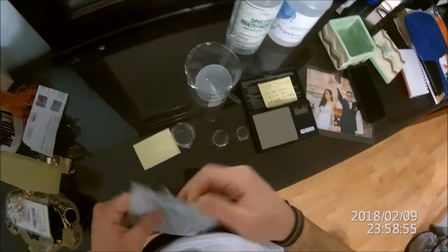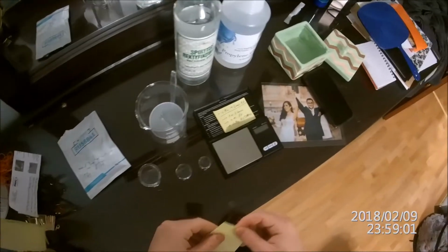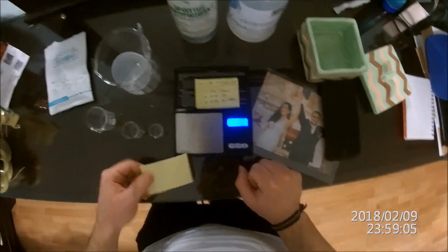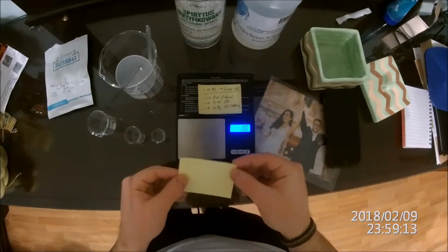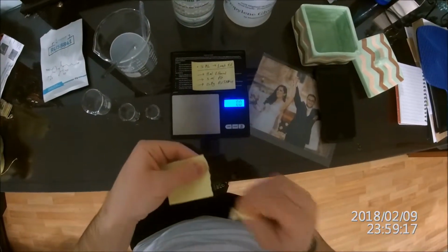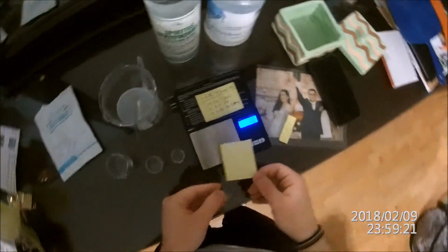So now what we're going to do, since I'm making 16 milliliters, like I said, I need 0.8 grams of this. Now here's the kind of tricky part. We have the scale here. Okay, so I need to put 0.8 grams of RU on this scale, and I need to be as accurate as possible.